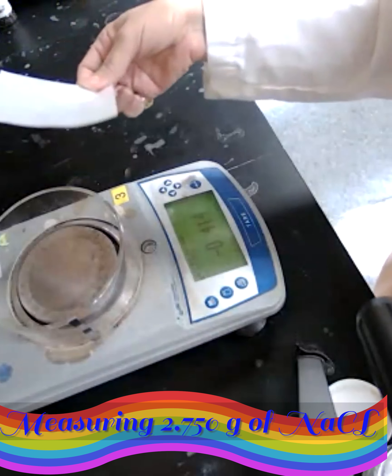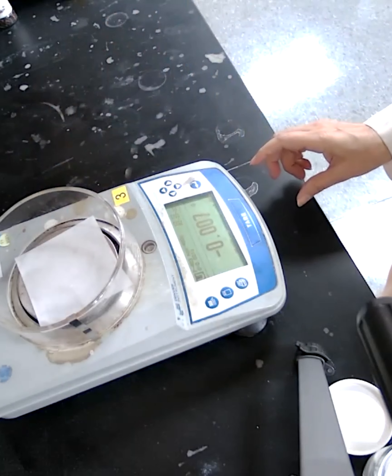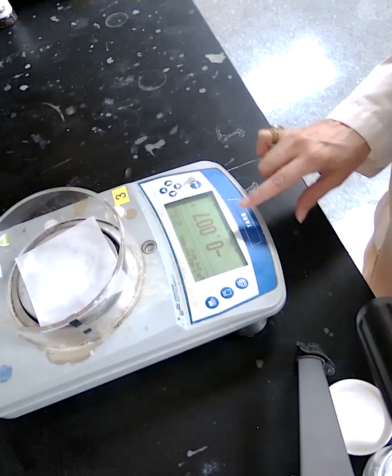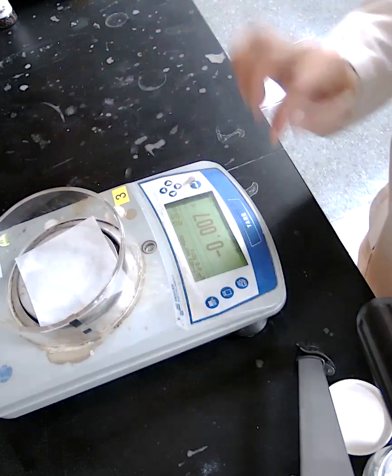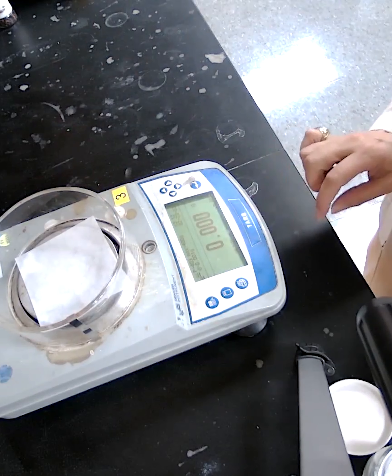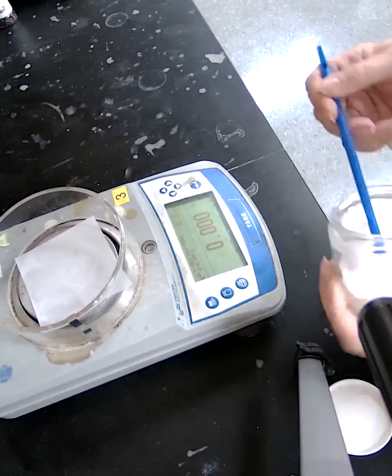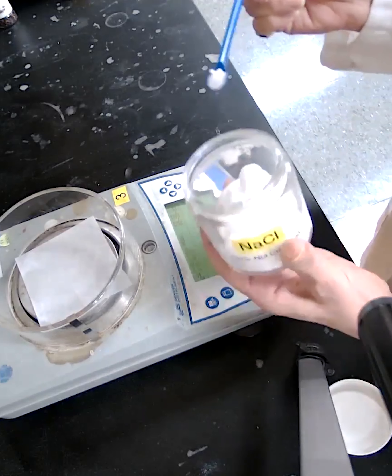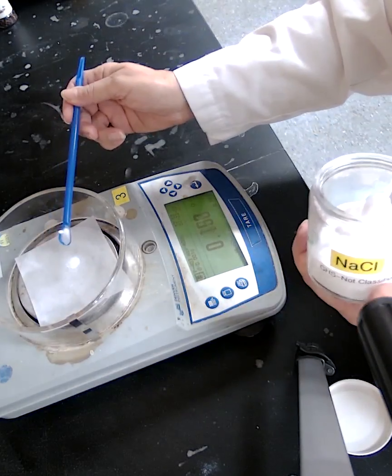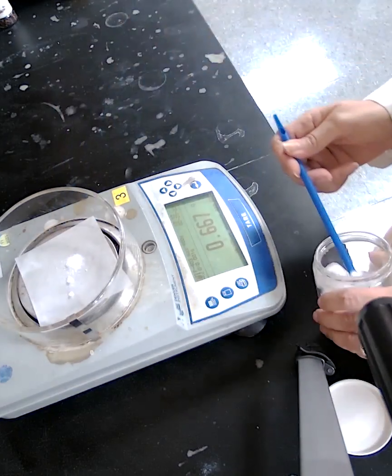In this part of the experiment, we want to measure exactly 2.750 grams of sodium chloride. Place the weighing paper on the scale and press the tare button so the mass of the weighing paper is not included. Then, using a container of sodium chloride, add enough until the reading shows 2.750.